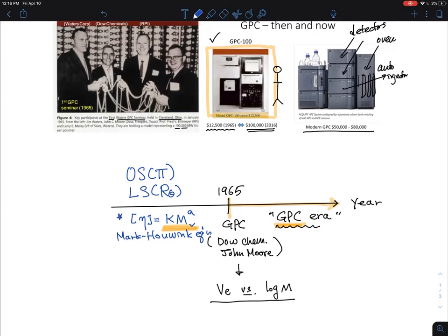And the beauty of this technique is that this is an absolute average molecular weight determination. So you can get Mn from here, you can get Mw here. So now polymer synthetic technique has advanced, so that the technique of making monodispersed polymer was reported in about the 1950s.